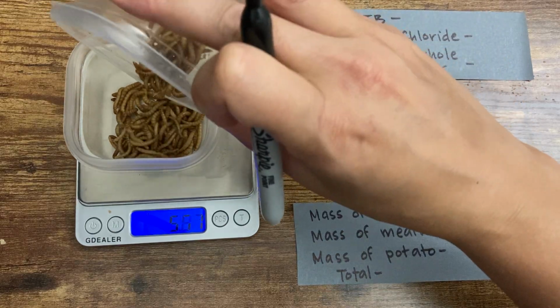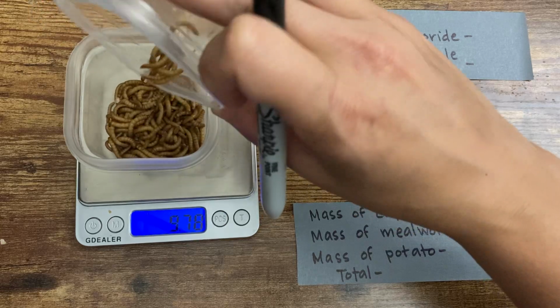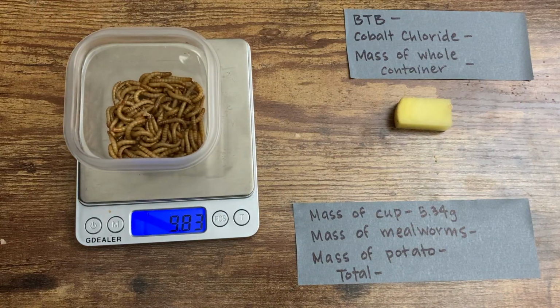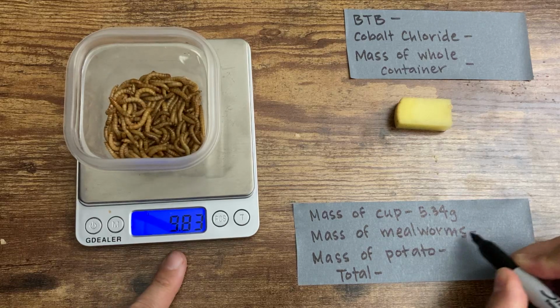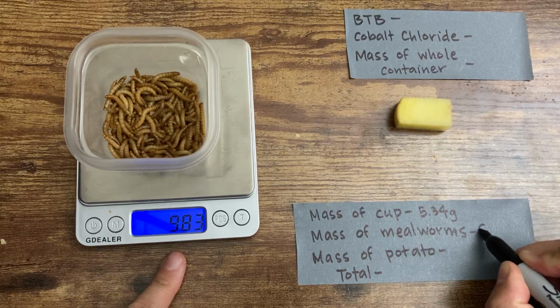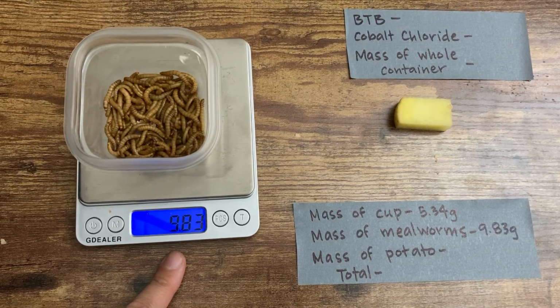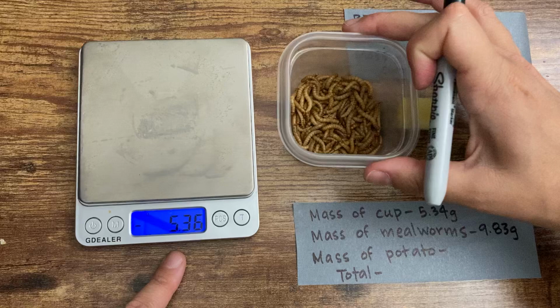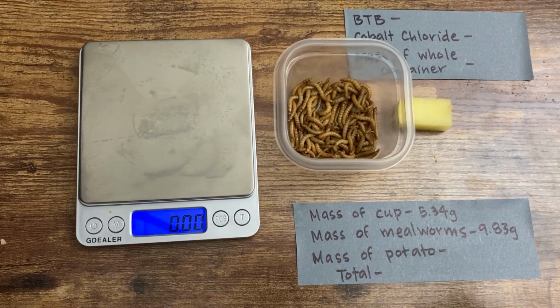So I need about 10 grams of mealworms. It can be a little more, it can be a little less, so we'll go with a little bit less. And my total for the mass of the mealworms is 9.83 grams.